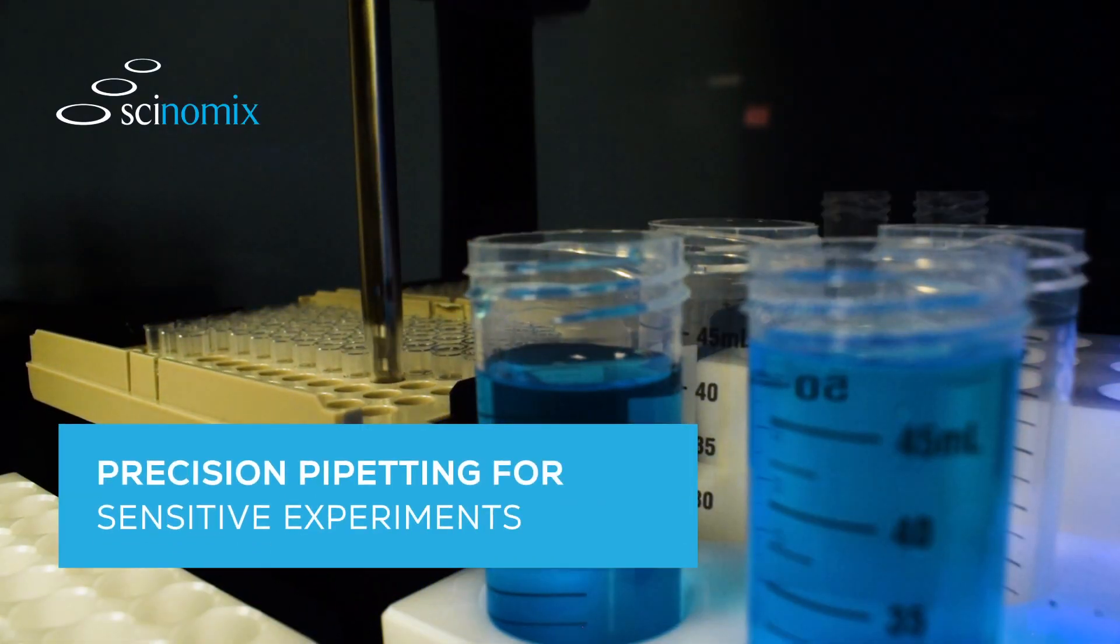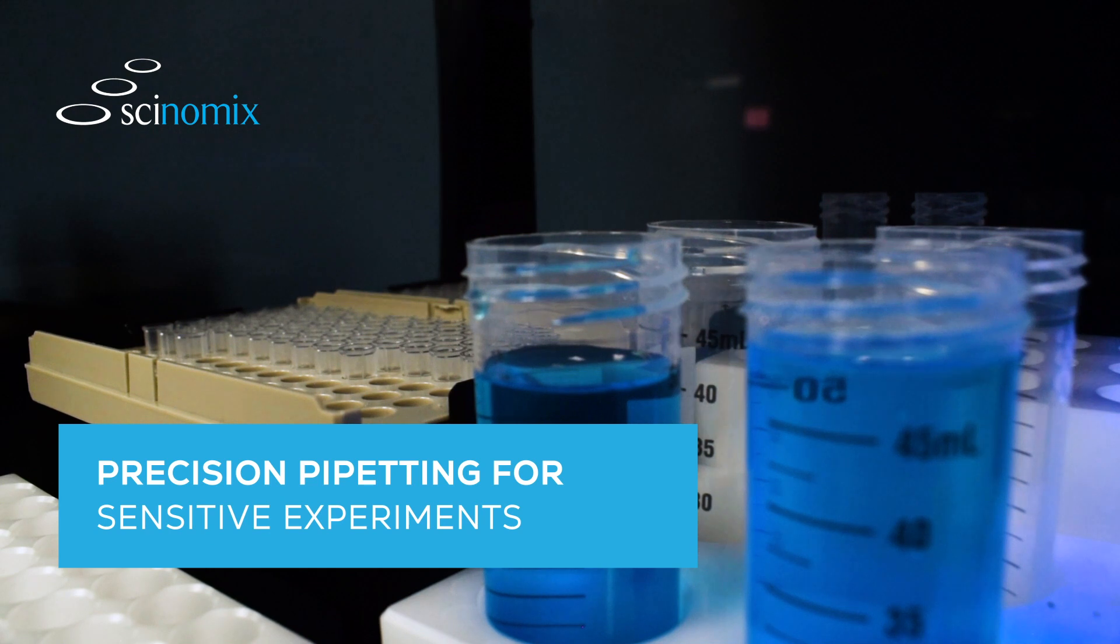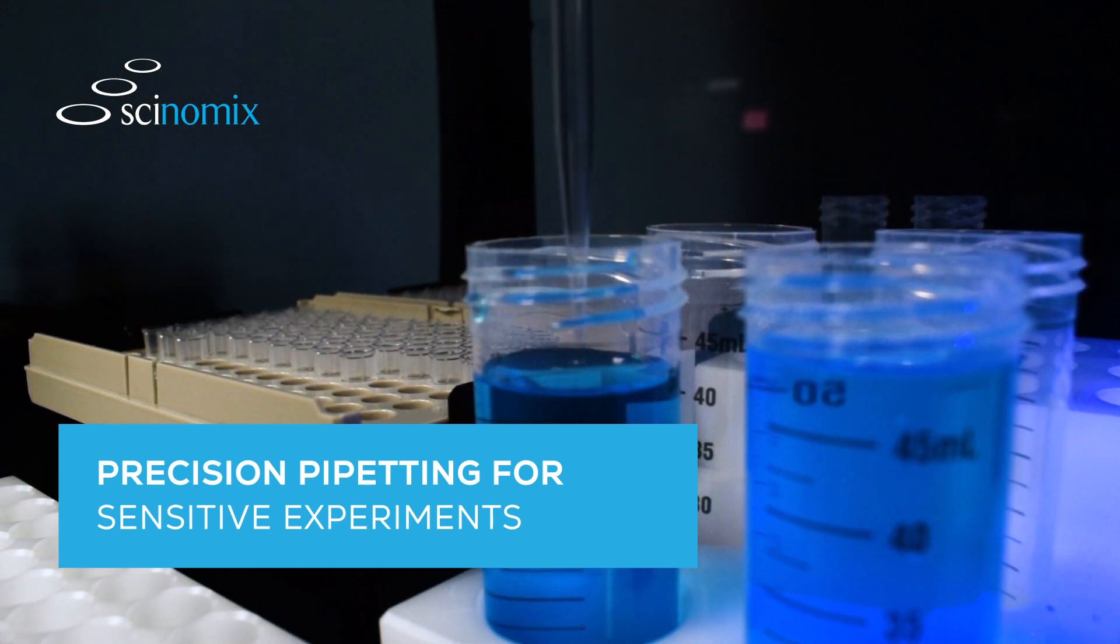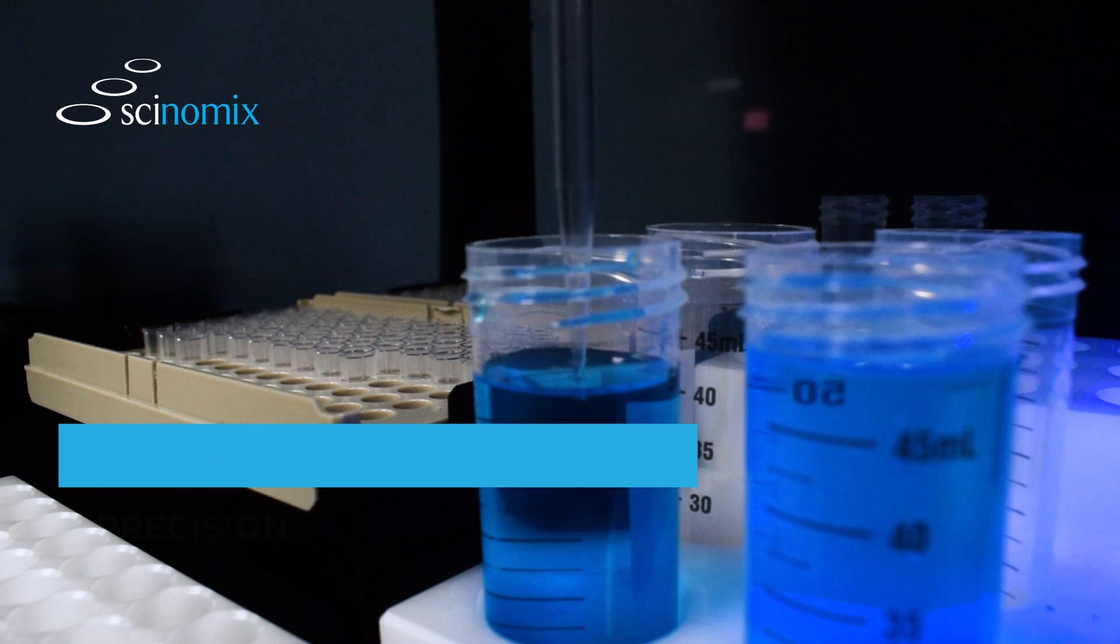Leverage the Synomics Air Displacement Pipetter for accurate, contamination-free pipetting, essential for sensitive PCR setups and high-throughput sequencing.